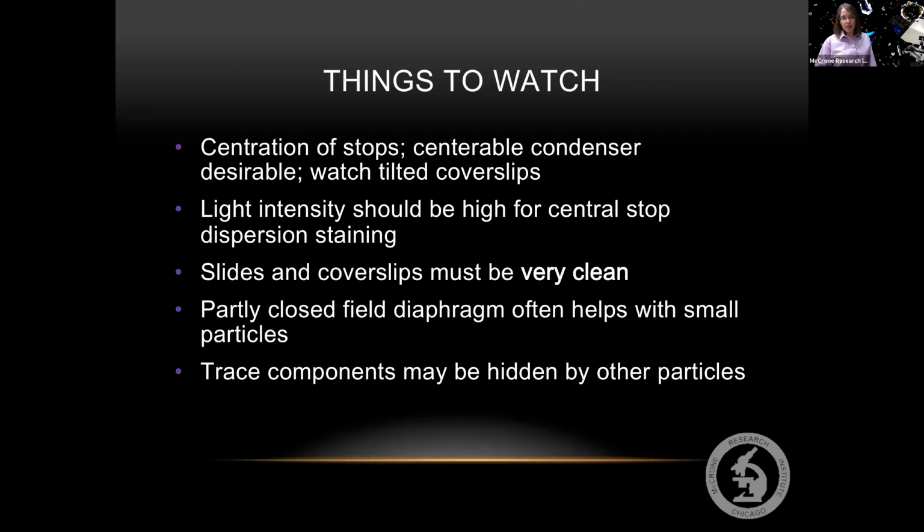If you end up having fingerprints on your cover slips or get drops of refractive index liquid on top of your cover slip, this can obscure things that you're trying to see. If you need to, sometimes closing the field diaphragm a little bit can be helpful as well.